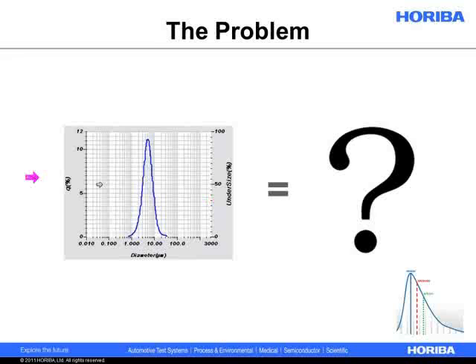Now the problem is, who knows what the heck this graph is telling you, right? If you're brand new to the technology, brand new to the analyzer, brand new, frankly, to particle size, because how many of us learned that when we were going through school? It's just going to look like a big question mark.